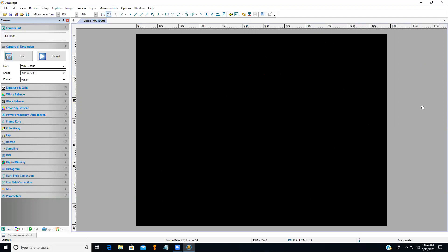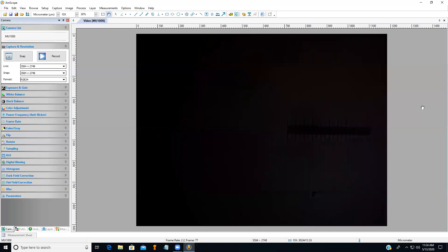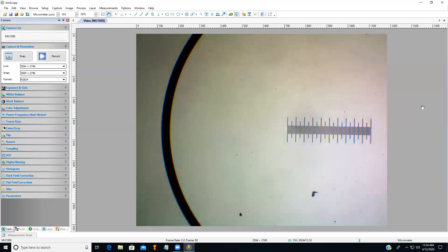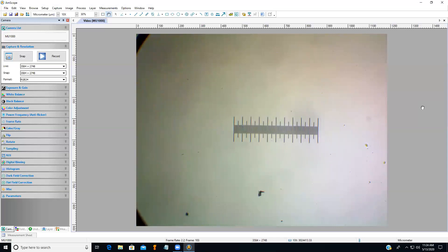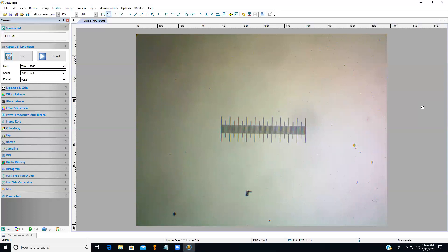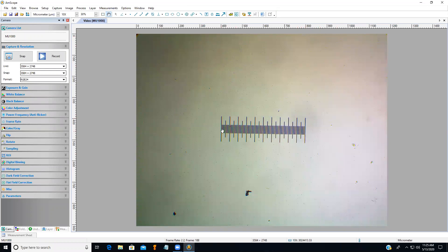So I'm going to just flip the switch on the scope. You can already see the ruler there. I have the light all the way down. I can increase the light intensity a little bit with that little scroller on the side of the scope. Now you can see the scope. I'm going to move using the knobs that operate the stage. Using the fine focus, we can find the focus on this. And here I'm starting at the lowest magnification, 4x. So you should see the entire ruler of the stage micrometer. This entire thing is one millimeter. So there's 10 of the bigger parts of it. So each of those is 100 micrometers, and each of the tiniest segments is 10 micrometers. So we're going to operate under that knowledge because nothing is labeled. But we know that.